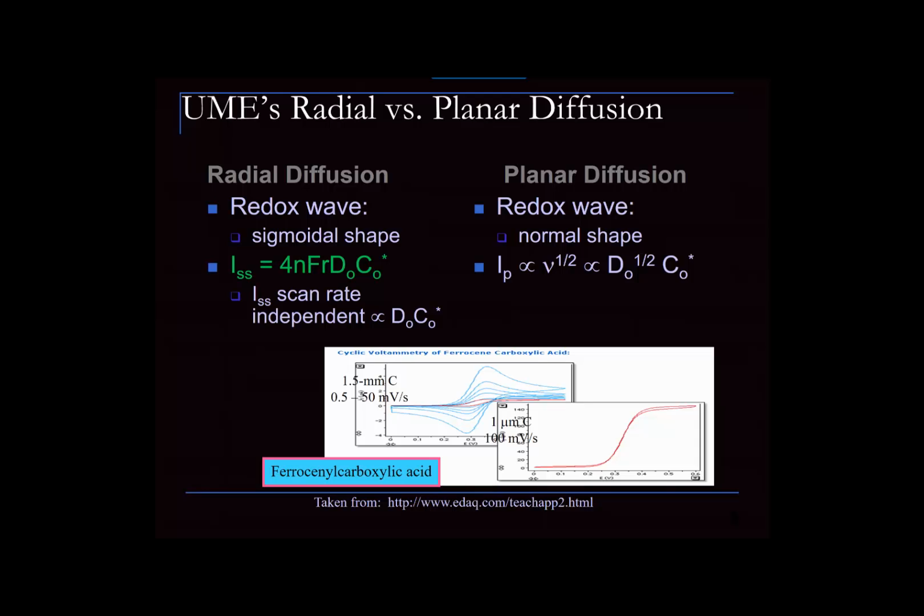So on this slide, you're looking at two sets of voltammograms. Both are for a compound referred to as ferrocene. I mentioned it to some of you in lab. This is two cyclopentadienes sandwiching an iron(II). And that iron(II) can undergo oxidation to an iron(III). So it's that iron(II), iron(III) that is the redox couple in ferrocene. It's a very stable compound, and it actually is used as an electrochemical potential standard in solution by the International Union of Pure and Applied Chemistry.